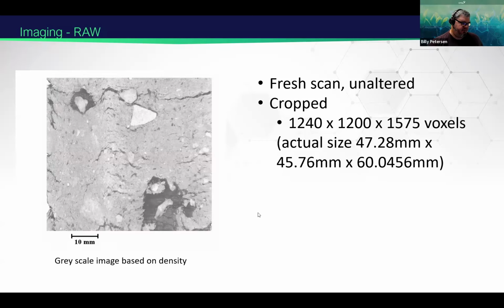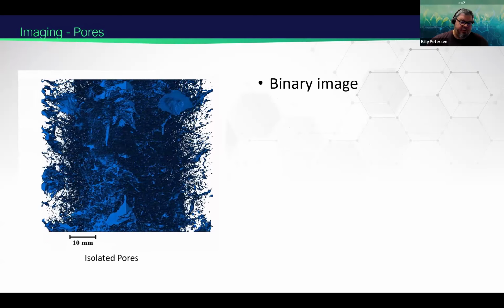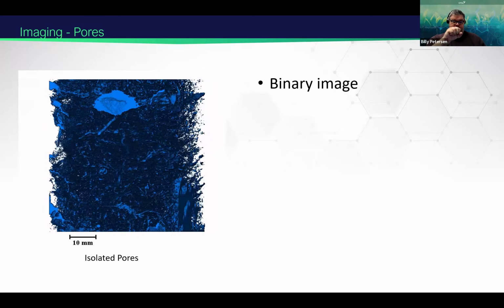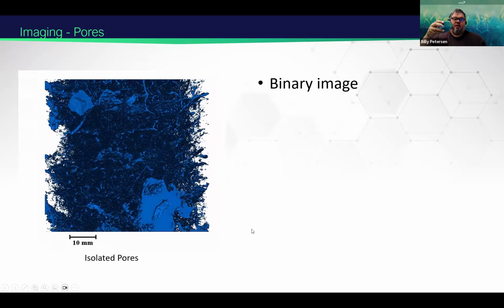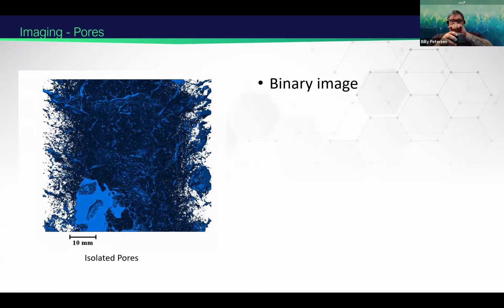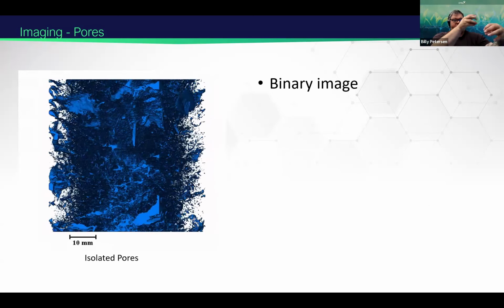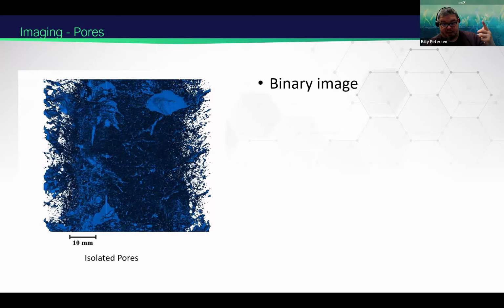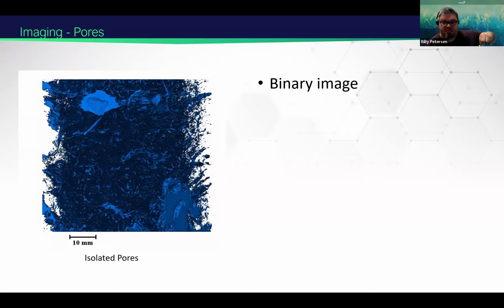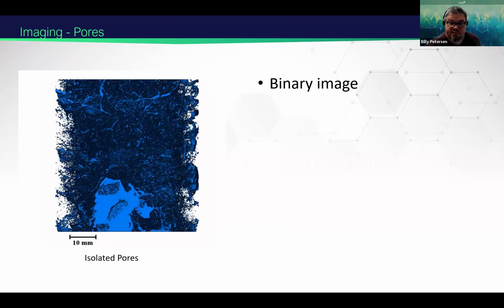The connection itself, actually, let's go to the next one. There we go. The connection itself is actually based on the voxel and the voxel location. So if we have a voxel here, and it does a measurement of all of them around it, and then it does a measurement of that one, which is connected, then that one, and then that one. So it's based on connectivity from the maximum to the minimum points of the pore. And it goes in all axes, all three axes.